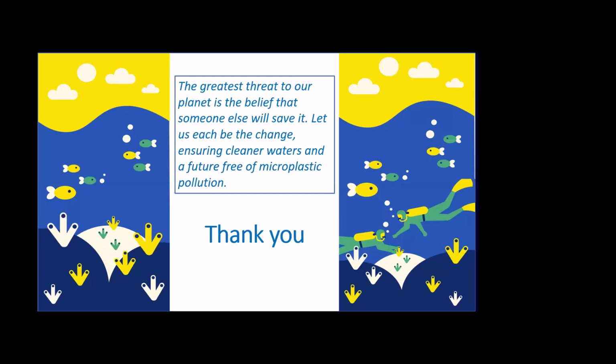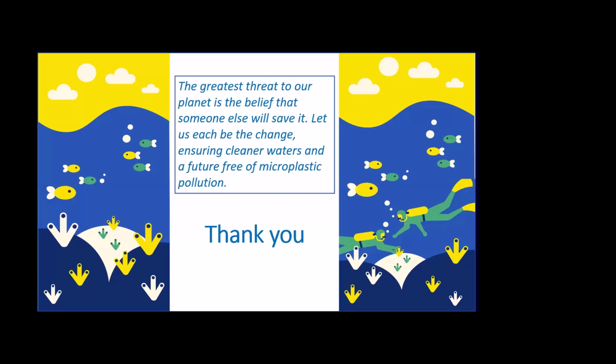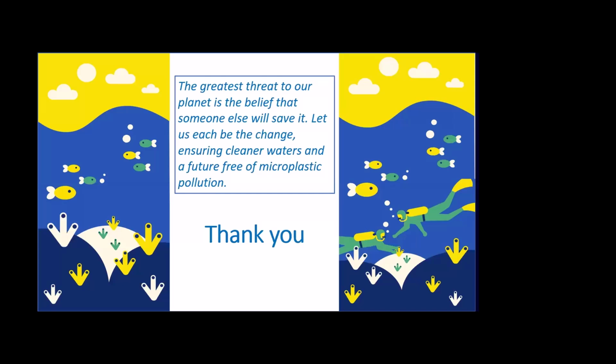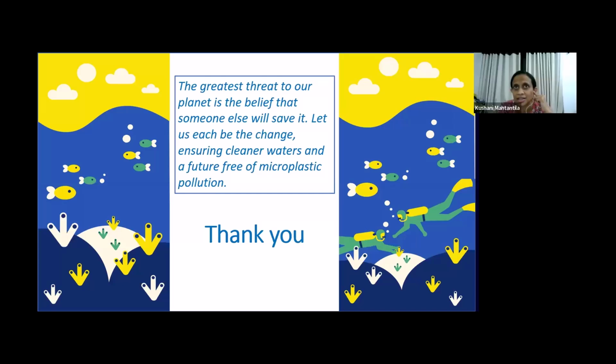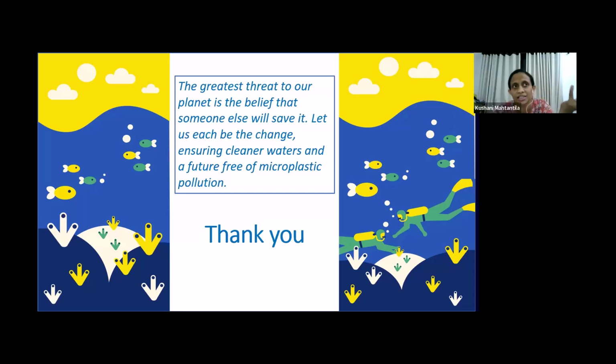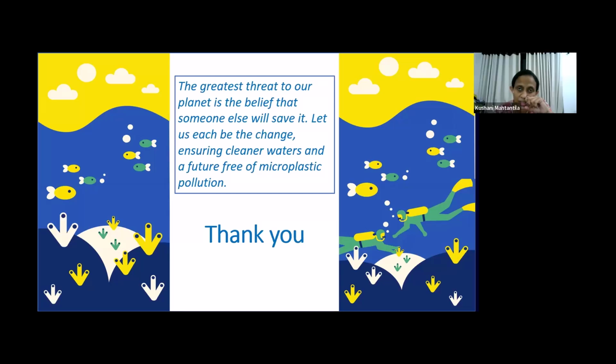That is not in the literature, but the problem is we would have to dissolve the plastic material into a liquid system. The chromatographic system that the literature has used is GC, where they pyrolyze the sample into a gas and analyze the gases. But I have not seen HPLC techniques anywhere. Theoretically, we would have to take the samples into a liquid form to inject into the HPLC.